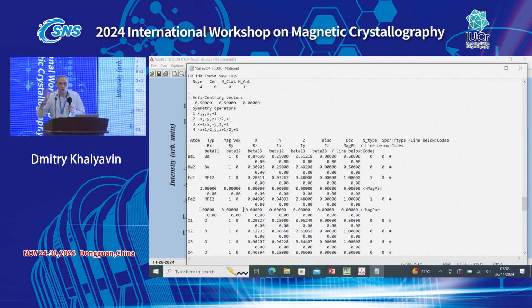I don't know if it is good or not. Our data are pretty good, and of course it will depend. As a first try, we have 2 iron, symmetry non-equivalent, and we are allowed to change all 3 components of the magnetic moment on them. Let's vary all of them and see what happens.